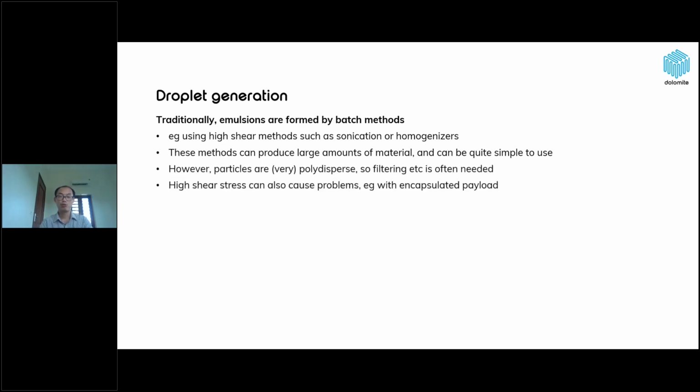However, with these methods the particle size is polydisperse, so we need to filter the product after formation. And the high shear stress or high input energy can also cause problems with the encapsulated payload, so it can destroy the encapsulant during the encapsulation process.